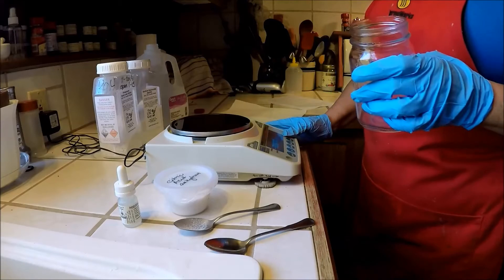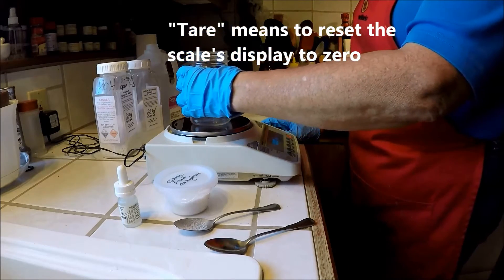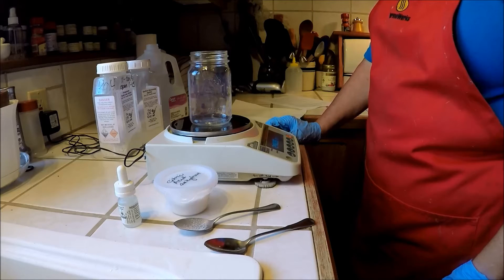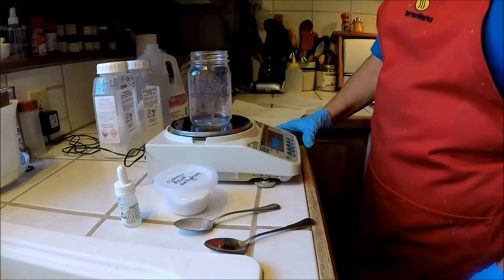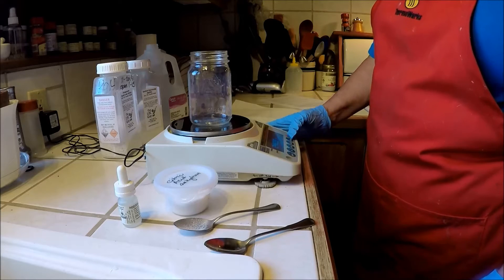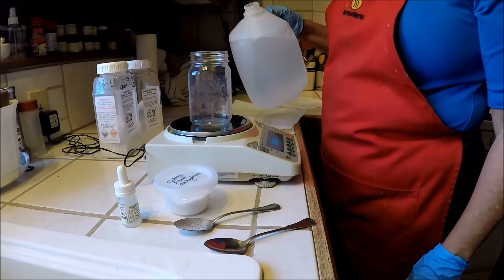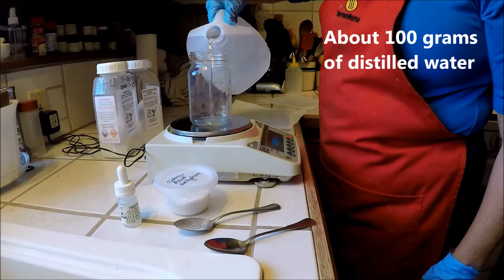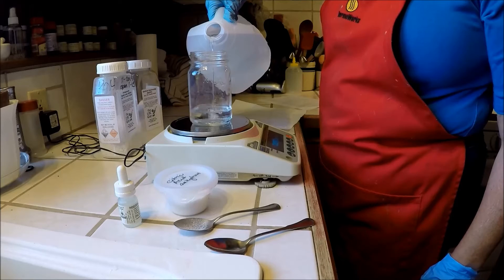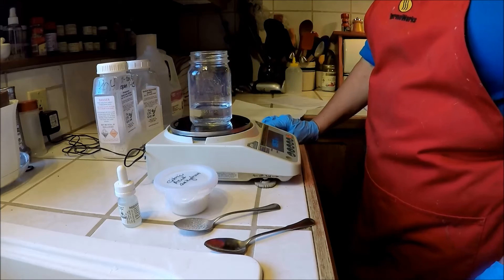The next thing would be to turn on your scale and tare it, meaning make sure it says zero. I'm going to put my jar on top of the scale — it's about 246 grams — and I'm going to re-zero it again so that it turns back to zero. Then I'm going to add about 100 grams of distilled water. It doesn't have to be accurate, just close. It says 105.76 grams.